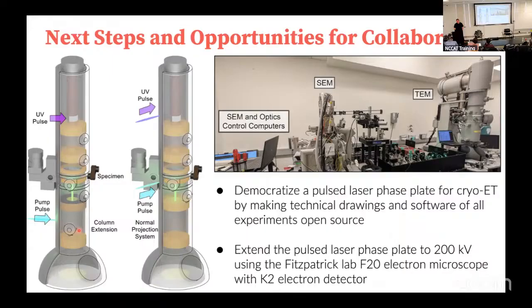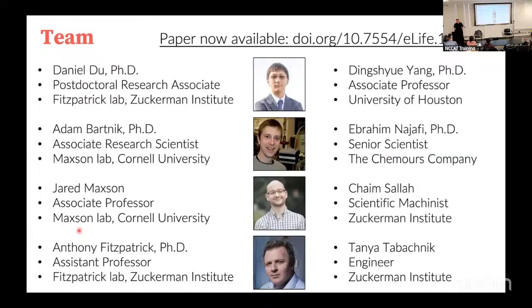And try to do it that way. But one way or another, we're going to try to see if this could work in a TEM. And so the paper, if you're interested, we just published it in eLife on this proof of concept work in the SEM.